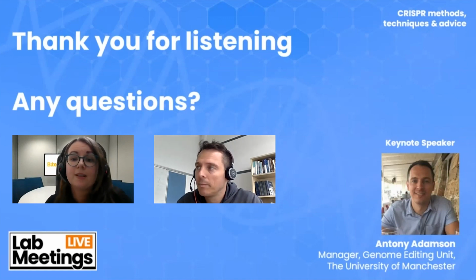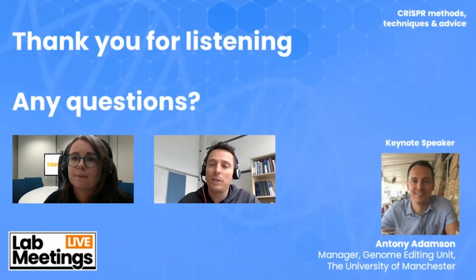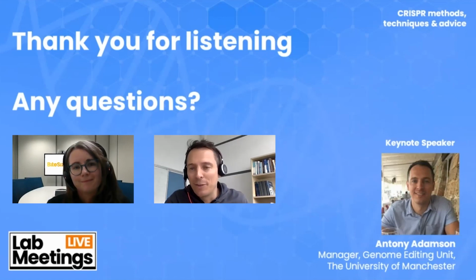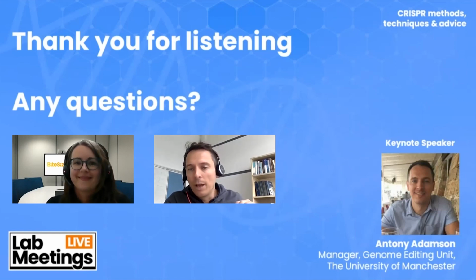So in the step for design consideration, why do they have to do exon deletion? It's just simply for ease of genotyping. It just makes your life so much easier, especially when quite often we make the mice and then we give it to the group. And the last thing we want is the group emailing us or phoning us every single time they've bred a new generation, saying, right, we've got these mice, how do we genotype them? How do we know which ones are the hets, the homozygotes, and the wild types? So we like to factor in a deletion where you can easily build a PCR-based assay that the group can easily apply going forward to genotype their colonies. Indels are absolutely fine. You can knock out the gene using indels in mouse. That will still work. But from a practical perspective, making an exon deletion does help matters downstream.